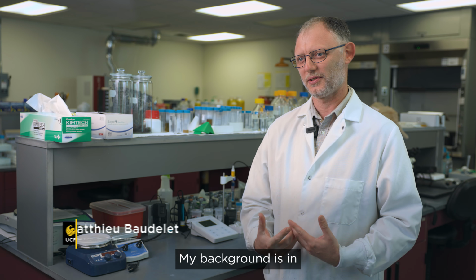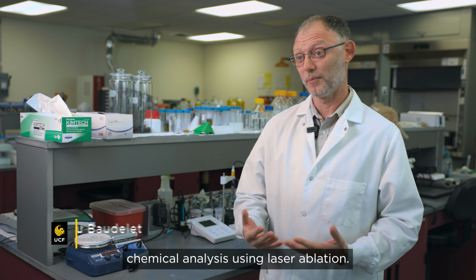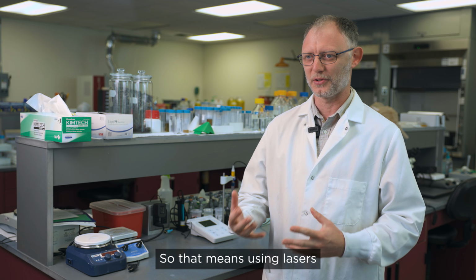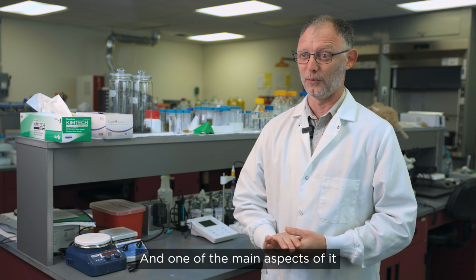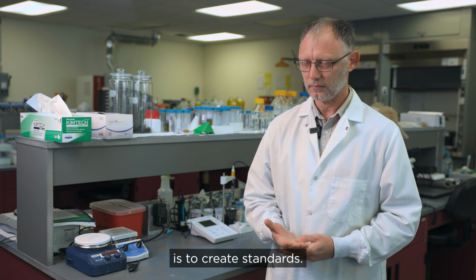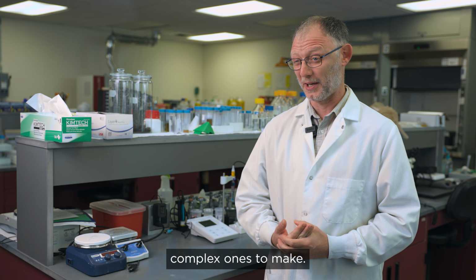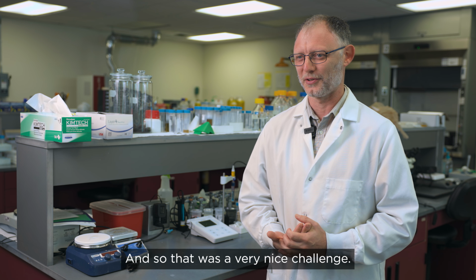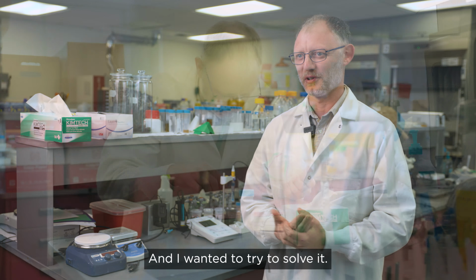My background is in chemical analysis using laser ablation. So that means using lasers for sampling little amounts of matter. And one of the main aspects of it is to create standards. And those standards are some of the most complex ones to make. And so that was a very nice challenge, and I wanted to try to solve it.